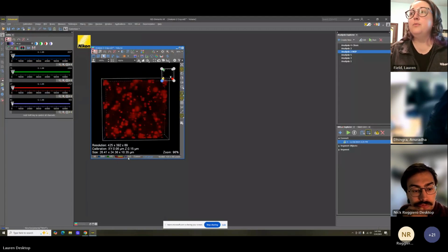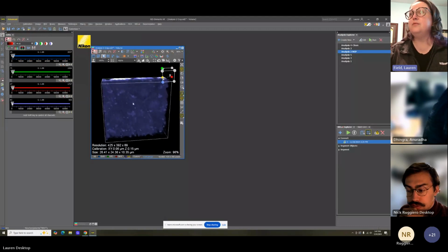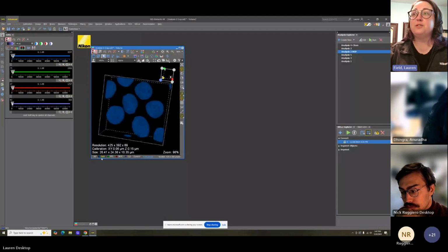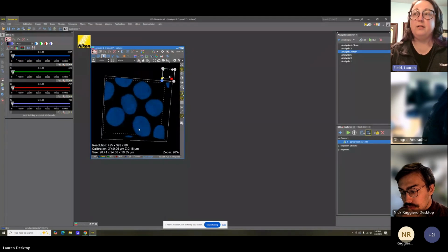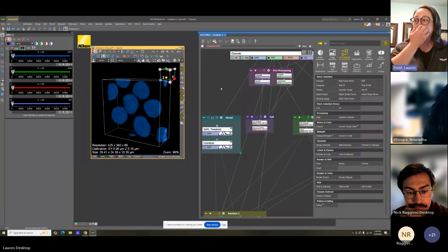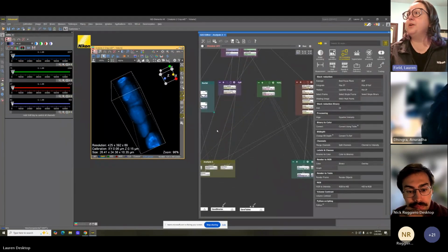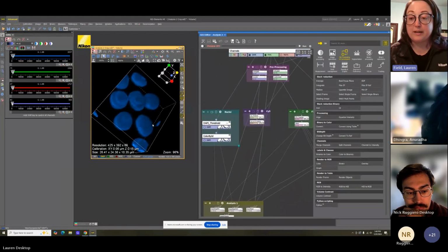When we're looking at it straight down, there is maybe some information in here that we would be able to glean out, but the easiest channel to threshold in this image will be the DAPI, as you have these really nice bright signal locations and then black backgrounds. So if we go into this analysis where it's looking at the volume, this one is a little more complicated. I'm going to go section by section. For DAPI, I don't think this needs any pre-processing.